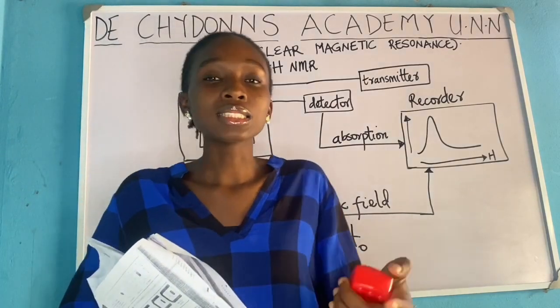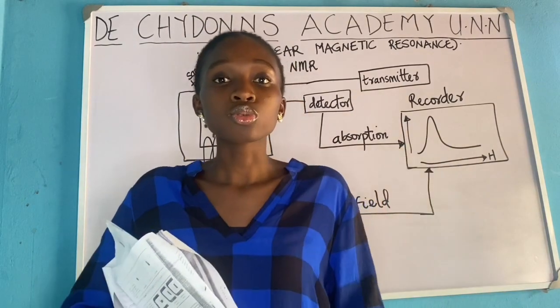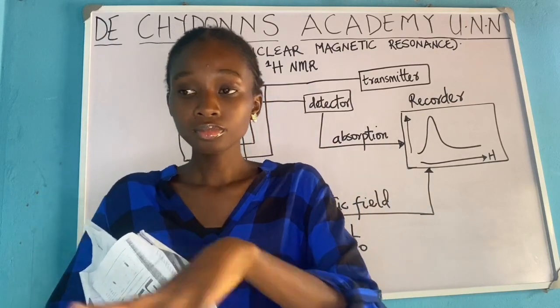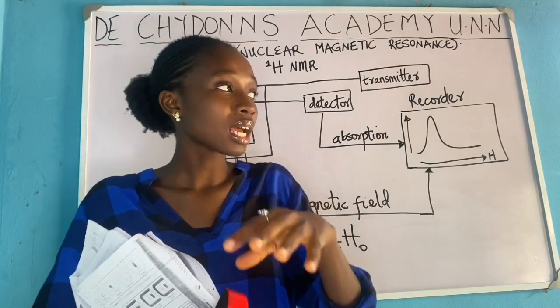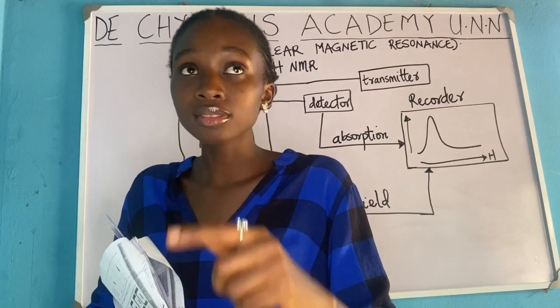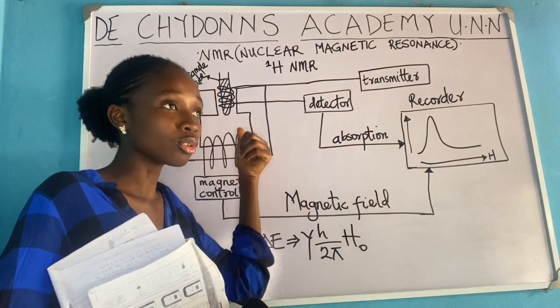It acts like an internal standard. In analytical chemistry, you add an internal standard to help remove errors that might arise from the matrix itself. Likewise here, you have to add an internal standard, and that internal standard in this case is tetramethylsilane. You have to put tetramethylsilane inside your sample mixture.